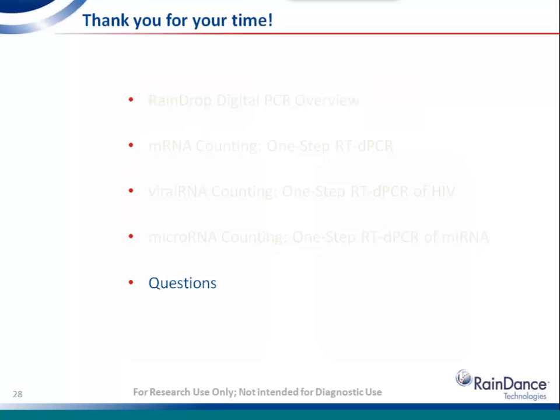Is it possible to use other real-time technologies other than TaqMan? Yes, I tried to point that out in one of the slides, that the system is open to a variety of reagents, and that's true both for the master mixes as well as the detection modalities.